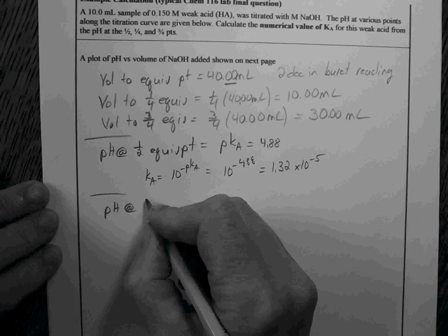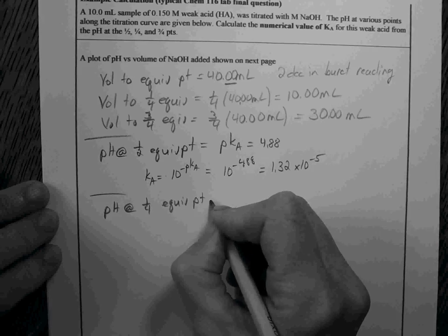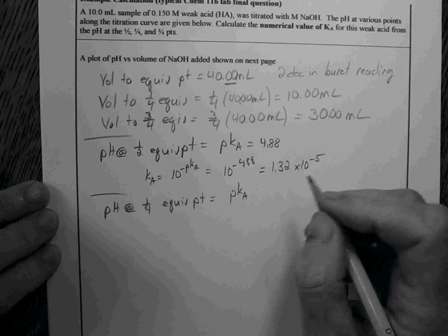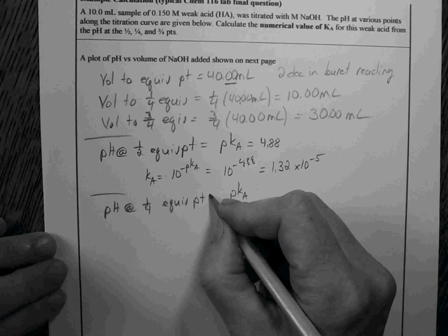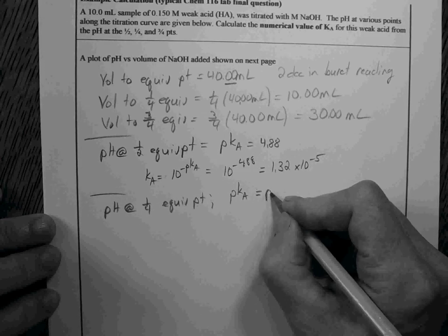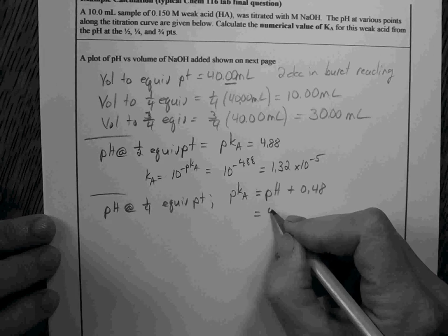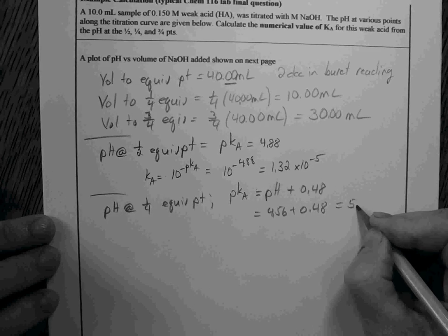Okay, so the pH at the 1/4 equivalence point. What's true at that point is that the pKa is equal to the pH at the 1/4 equivalence point plus 0.48. So we found that the pH was 4.56. We add 0.48, and that would equal 5.04.